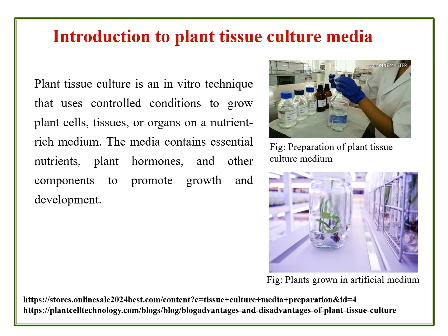The media contains essential nutrients, plant hormones and other components to promote growth and development. See the picture where the plants are grown in an artificial medium. Here the medium supports the growth and development of a single cell or a plant cell aggregate.